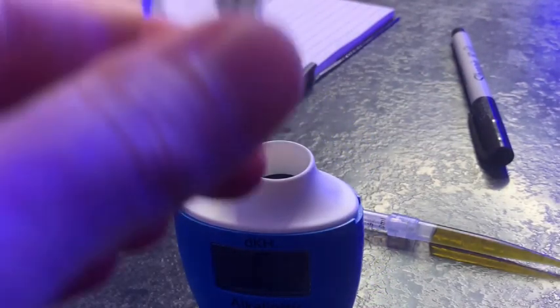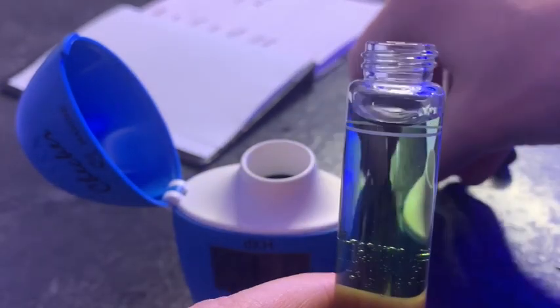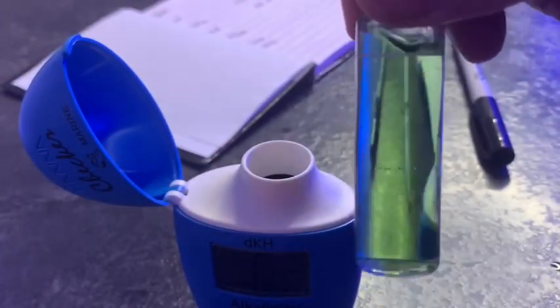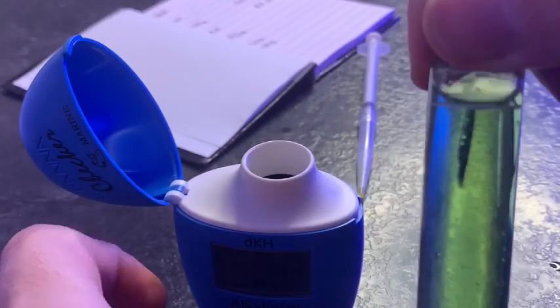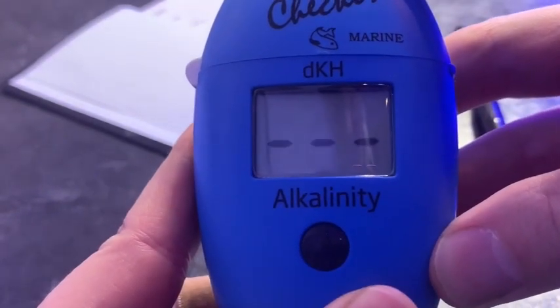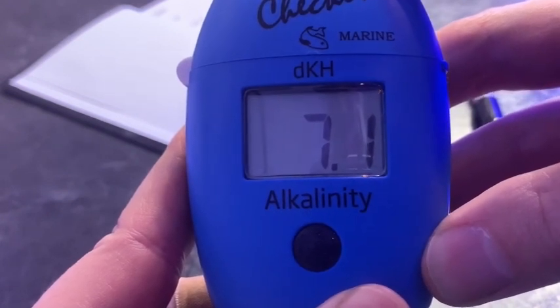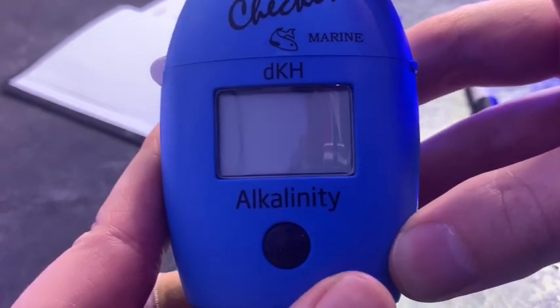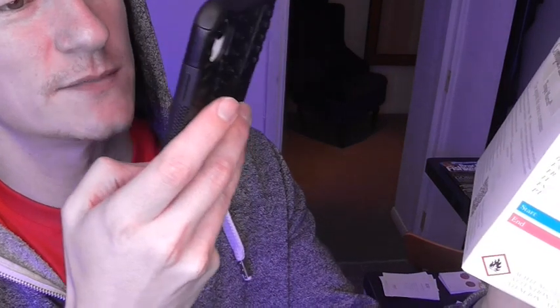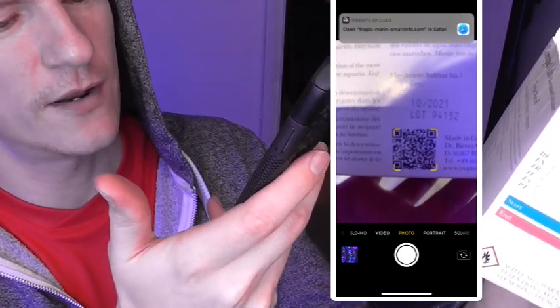That got me thinking — I wonder how accurate this test kit is. So I decided to double check with my HANA checker just to see. I was pretty chuffed to get 7.1, considering the Tropic Marine test kit came up at seven — I think that's pretty damn good. Another neat feature is that if you hover your phone's camera over the QR code, you can get some downloadable instructions, just in case you get these ones wet or need them on your phone — so that's really cool.